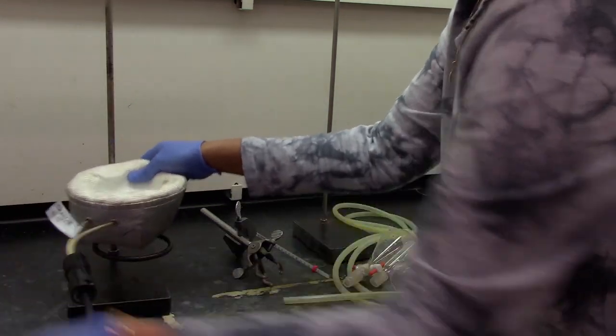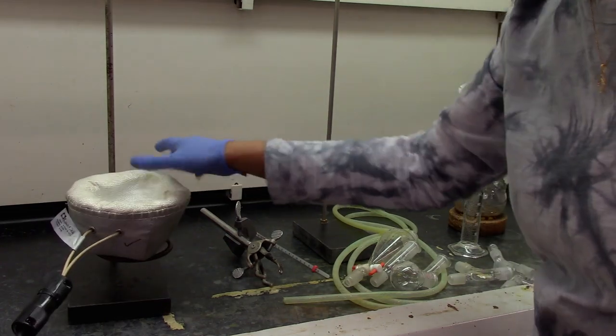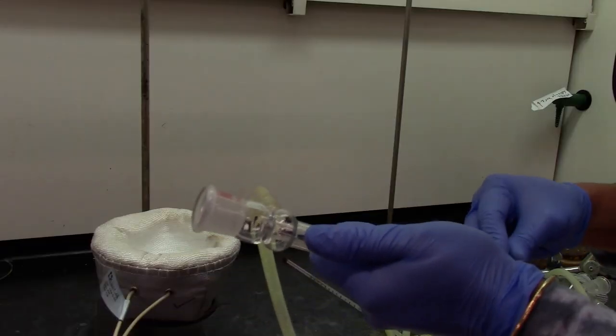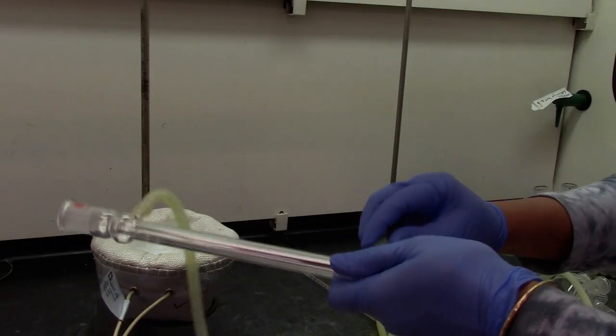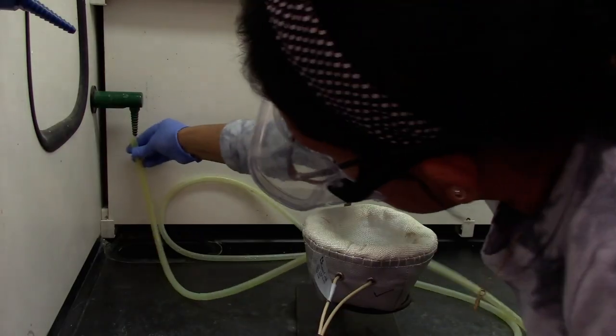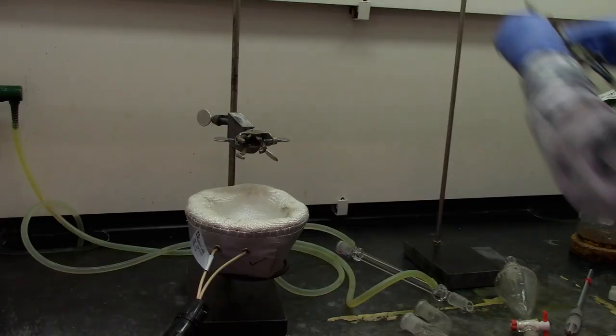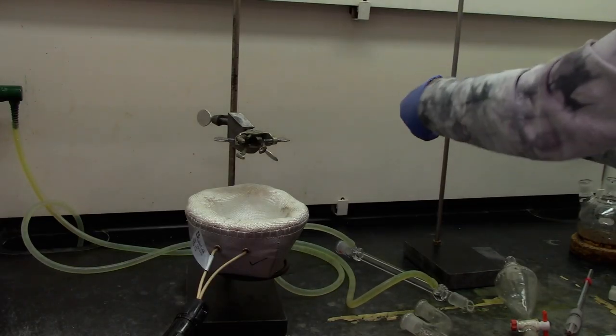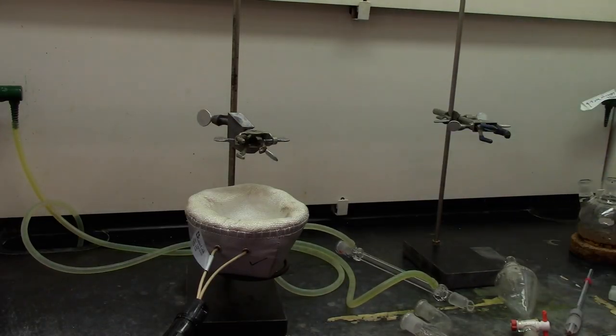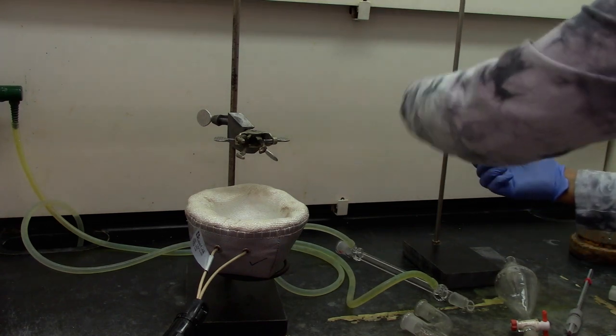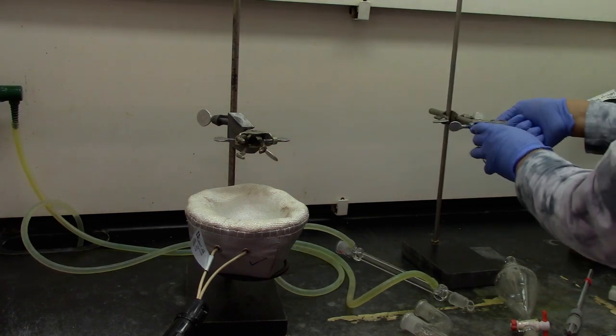Set up the mantle, the water connections to the west condenser, and turn on the water. Attach a clamp to hold the 500ml round bottom flask. And in a second ring stand, attach another clamp to hold the collection flask.